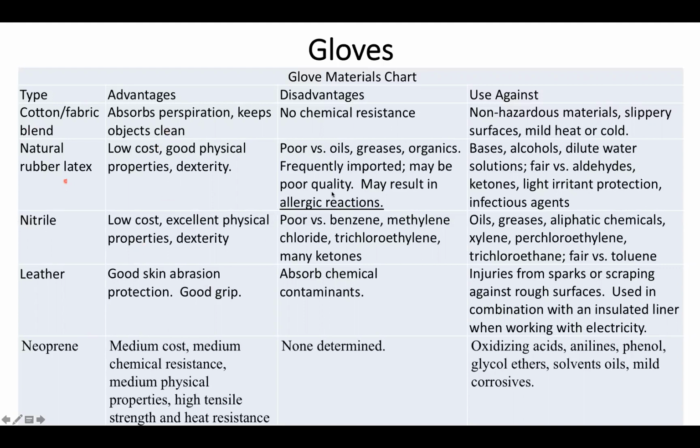One of the things you should watch out with latex is you may have an allergic reaction. So if you ever find yourself using latex and getting red skin or hands, watch out, you may be experiencing an allergic reaction. And one of the reasons why most labs have moved towards nitrile. And again, one of the things to watch out is that both of them are fairly poor against a lot of our organic solutions.